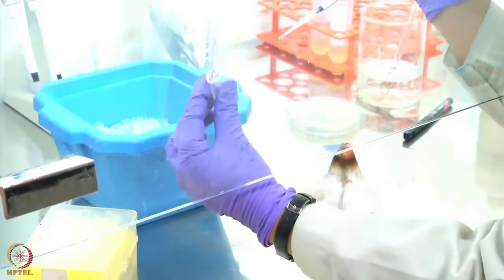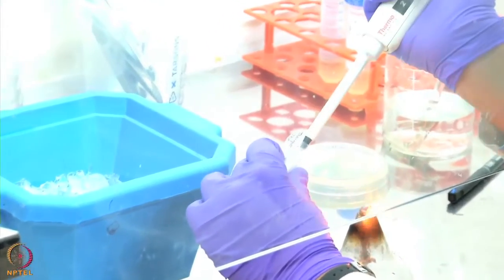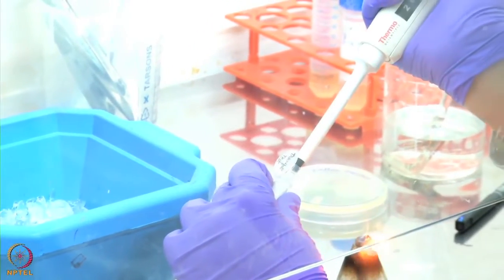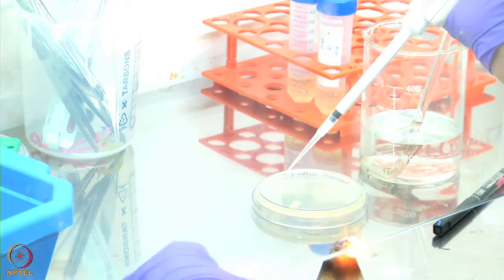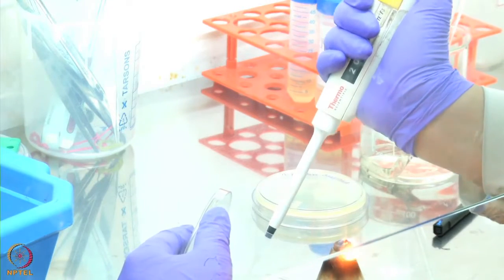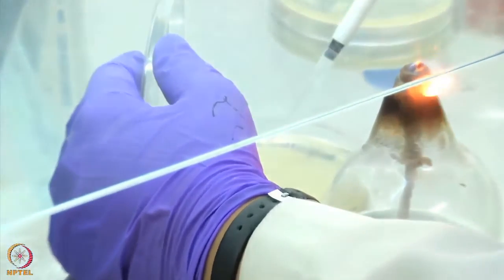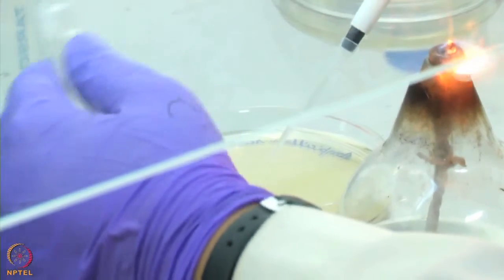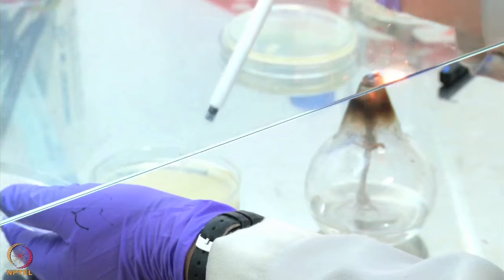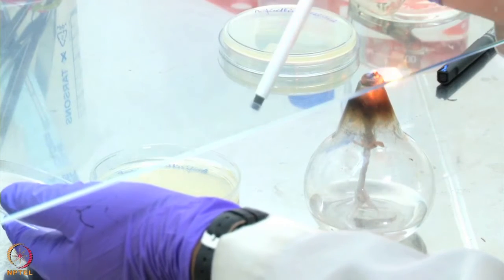So, I will take the sample. I will add the sample in drops.